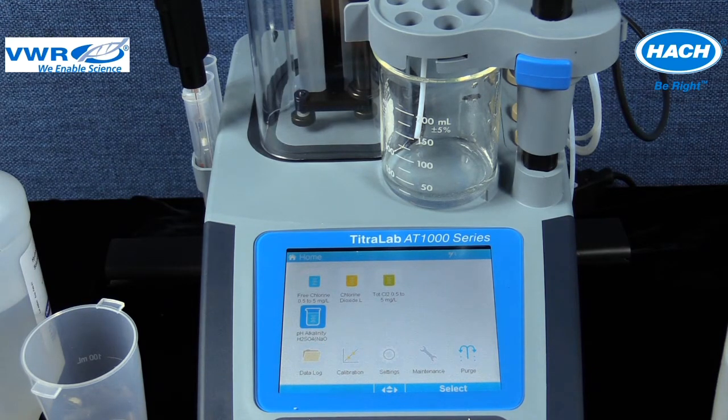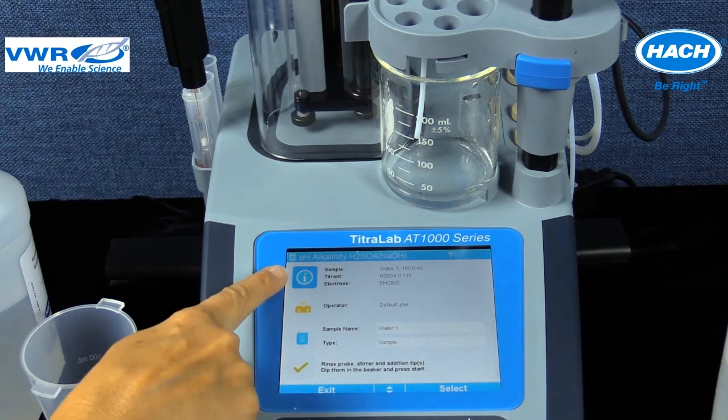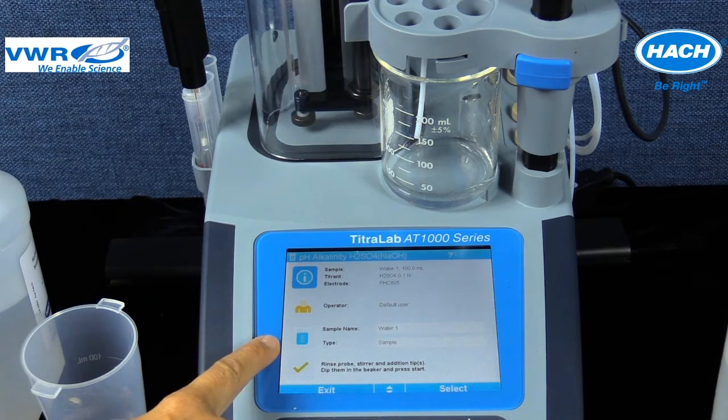For pH alkalinity, there may be more than one application choice. The method screen displayed next will confirm the following settings for this titration procedure, which includes the correct application at the top, the information icon displaying the sample volume, titrant, electrode installed, and any operator and sample information. The check icon details a few steps to prepare before starting the titration. When ready, the titration can be started by selecting the Start soft key.